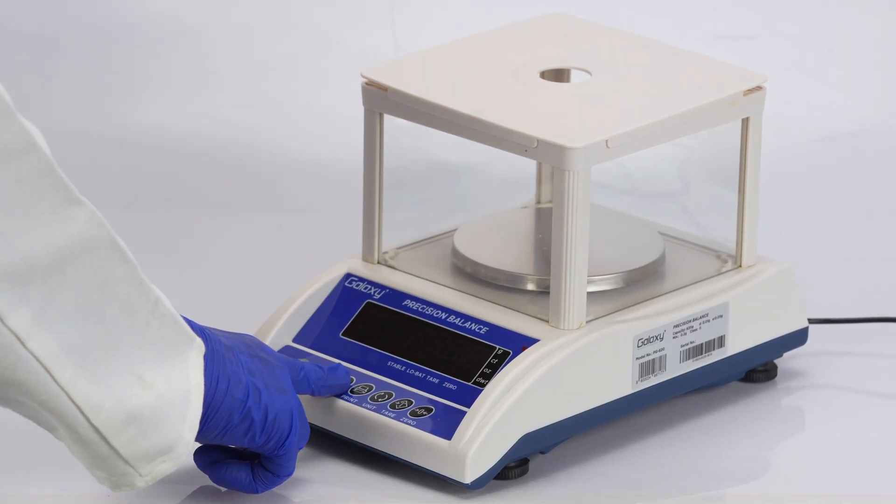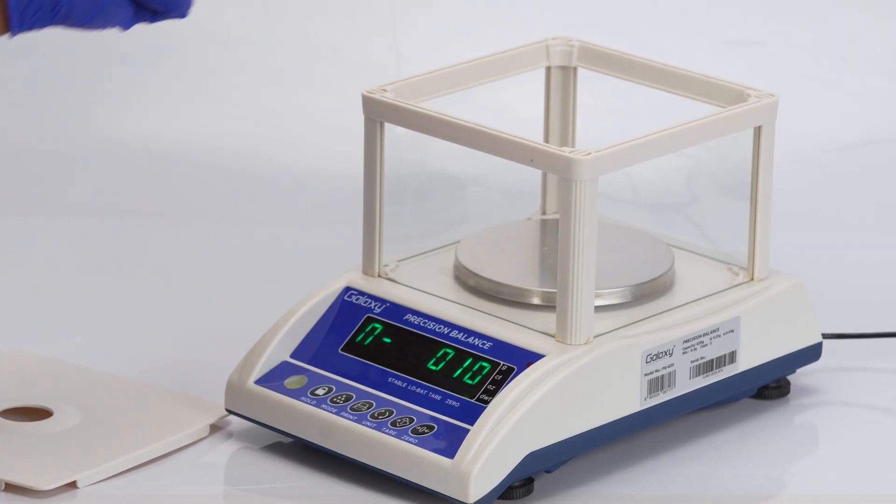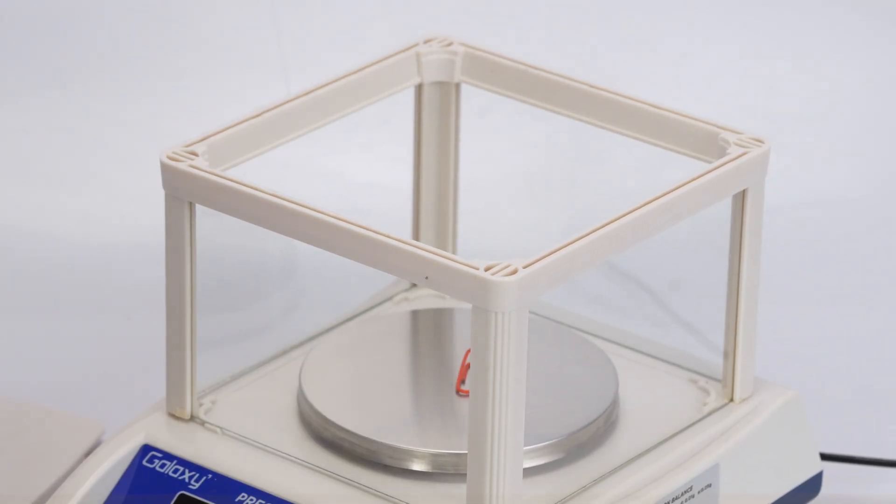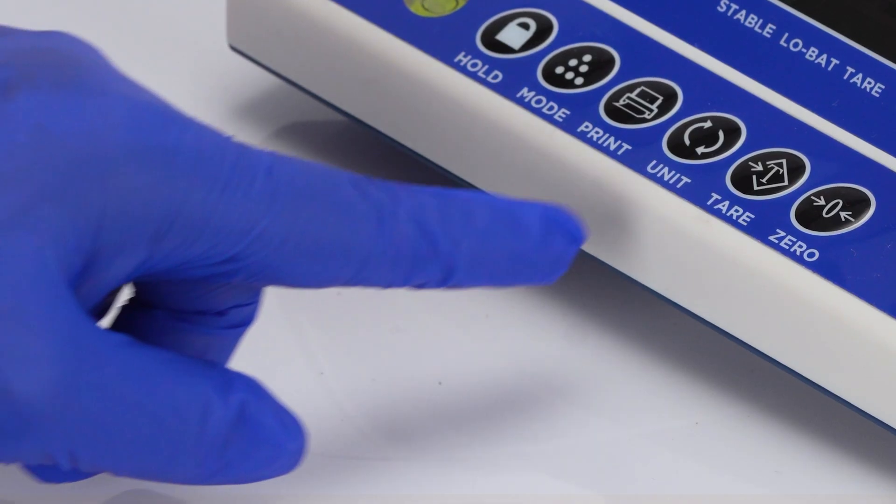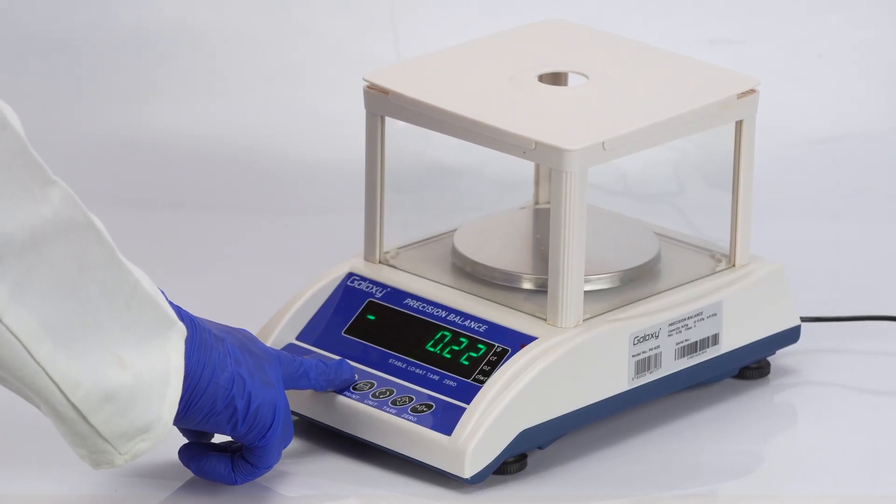To use the piece counting function, press PCS in weighing mode and place the sample to be measured on the pan. Press unit to input the quantity, adjust using tare or zero, then press mode to save.